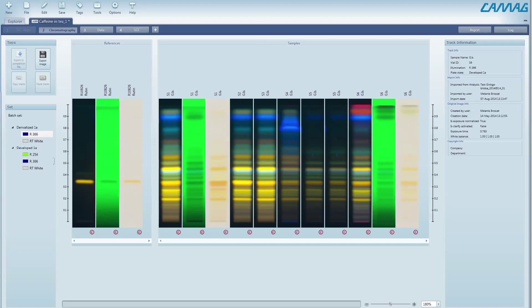The new sample-oriented approach allows for creating virtual plates from tracks originating from different plates for batch-to-batch comparison or long-term stability testing.